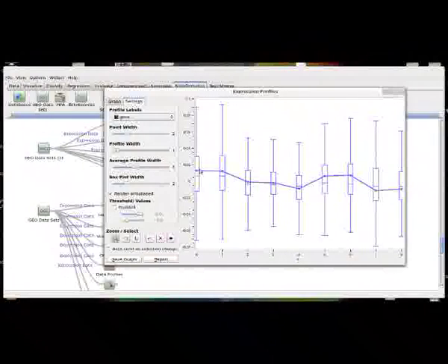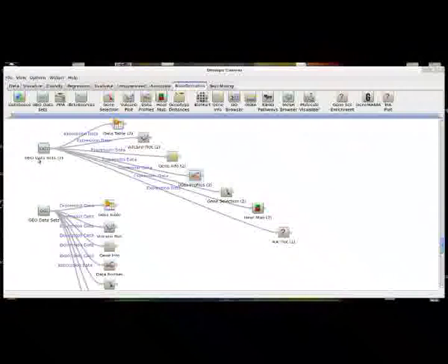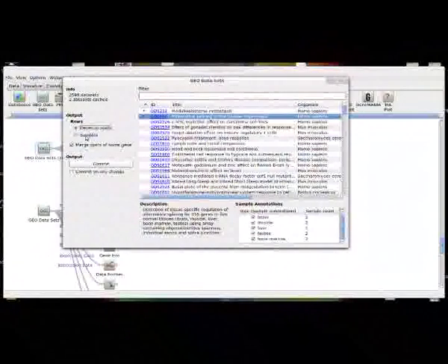So this is looking at the individual samples, and these are their error bars as far as the mean expression levels of the different genes, and we can see that there's pretty high error in all of these because when you're looking at on the order of 300 genes, and they're all randomly expressed, they're not part of the same metabolic pathway, there's a very large chance that they're not all going to be high and they're not all going to be low. These are not all genes with the same sort of molecular mechanism, at least in this example. So this is an example of where we might want to transpose our data set.